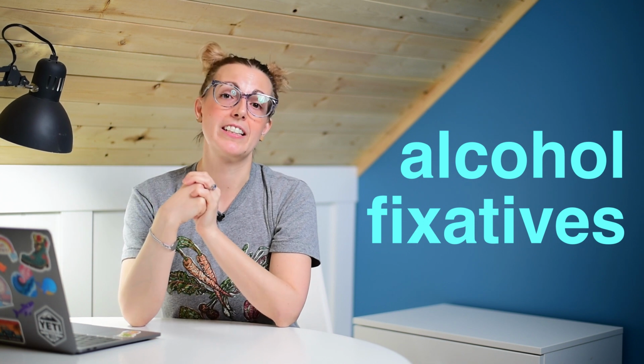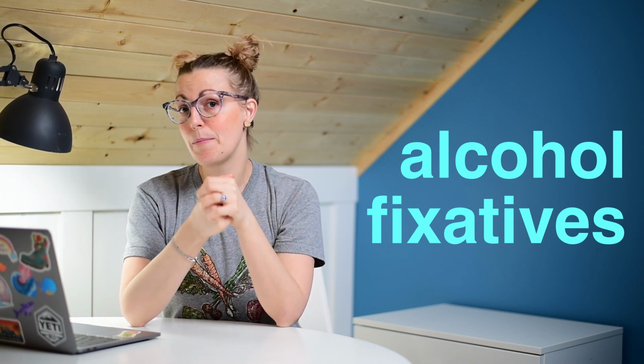So it's important to think about the type of fixative you're going to use, how it will be applied to your experiment, and what effect that fixative may have on your fluorescence detection. There are two main classes of fixatives: alcohols and aldehydes. So talking about alcohol fixatives, this is going to be your ethanol and methanol.